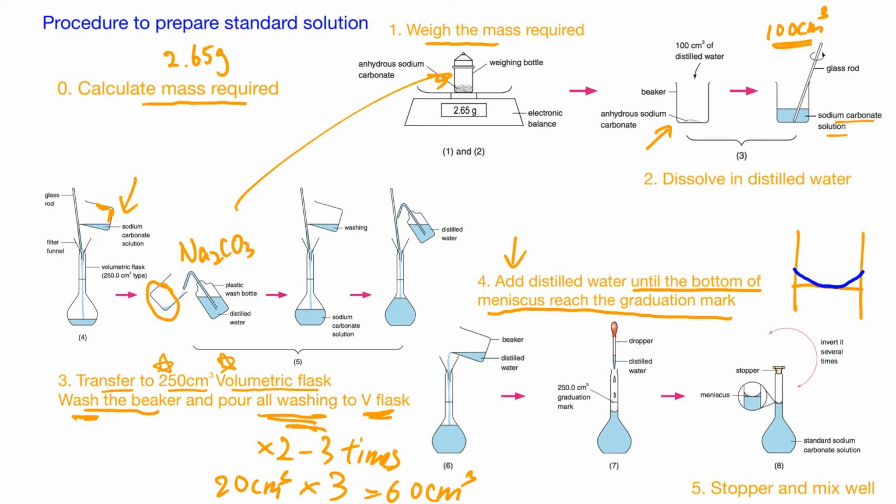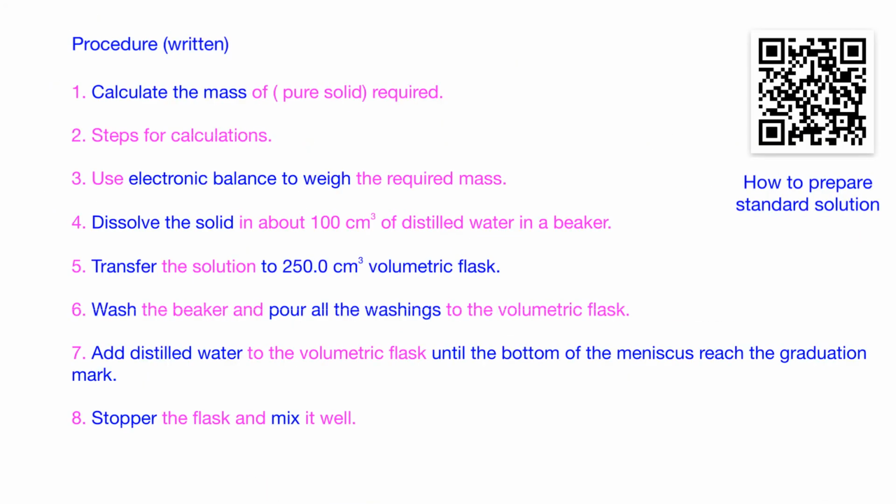So this is what you have to write. This is the most important statement. And afterward, you just need to stopper the flask, and then mix it well. It will be done. So, procedures in written format.